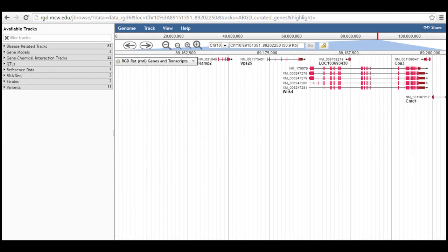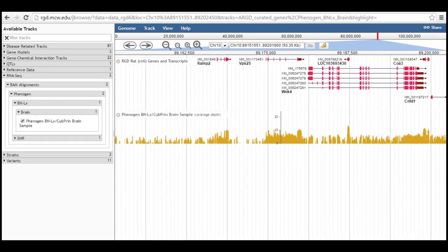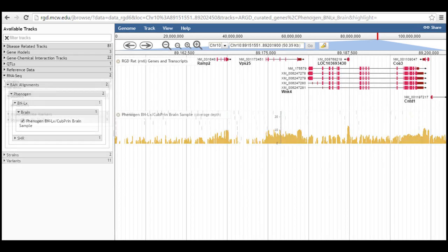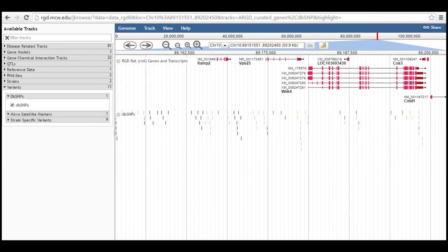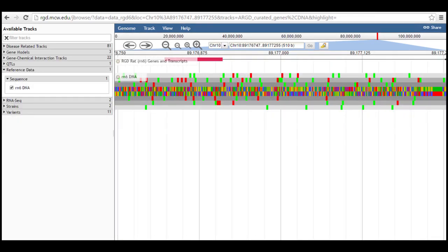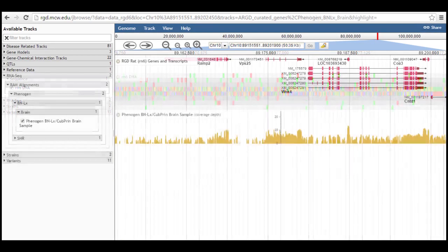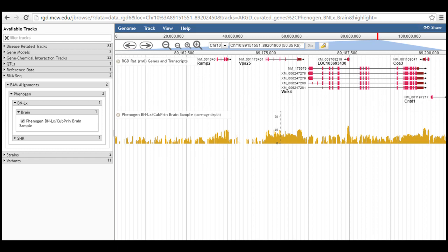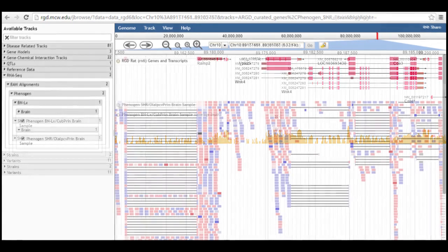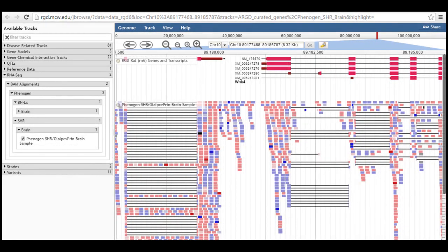Such as BAM alignments of RNA-Seq data, single nucleotide variance, and the reference DNA sequence. In the case of the RNA-Seq data, when the display is zoomed out, a histogram of the coverage depth is shown. Zooming in shows individual aligned reads.